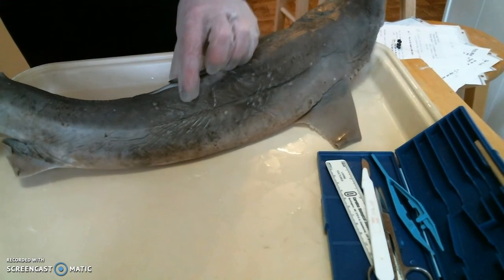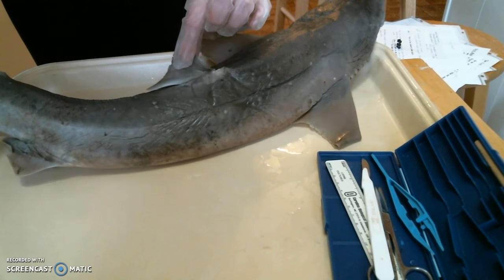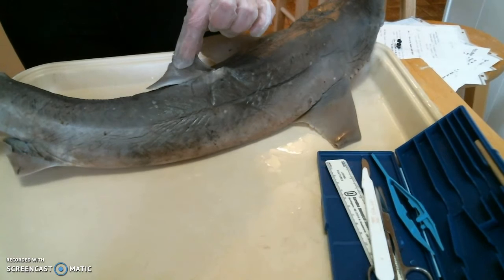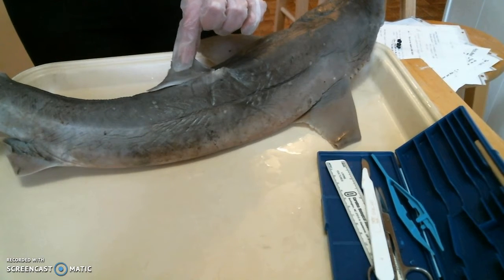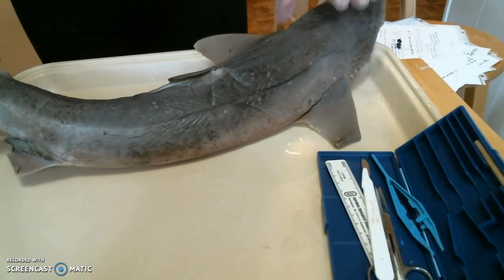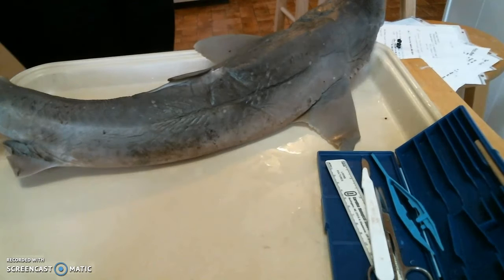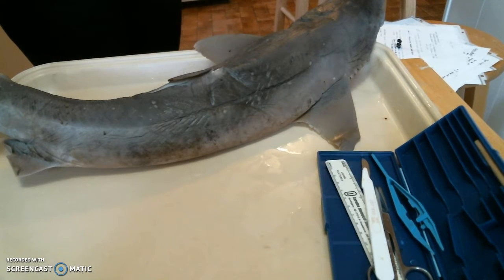Some instructions I've read have suggested that you cut off the dorsal fin so it can lie on its back easily, but I don't really think that's necessary. They seem pretty small and pretty flattened already. So I think that basically I would just take 10 minutes or so to have my students look at each body part one at a time.